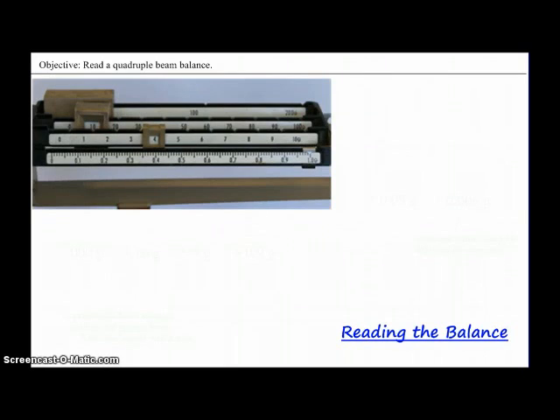When we read the balance, we focus on the four beams on the arm at the top of the balance. You'll see that the back beam, the one that's farthest away from you, represents 100 gram units. The one in front of that, each space represents 10 gram units. The second one from you represents a 1 gram unit. And the beam at the very front of you has a couple different units on it.